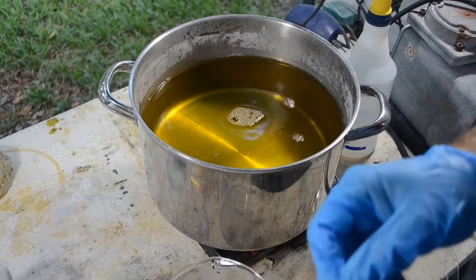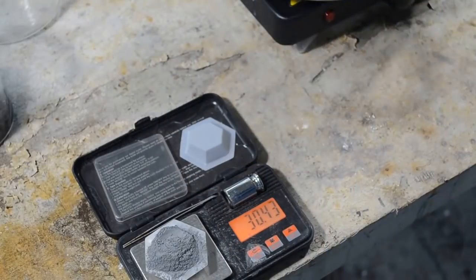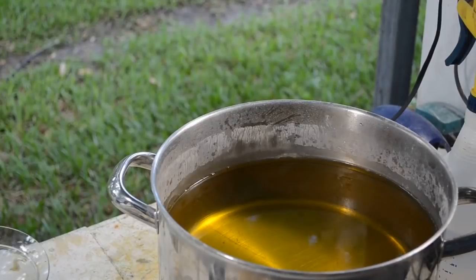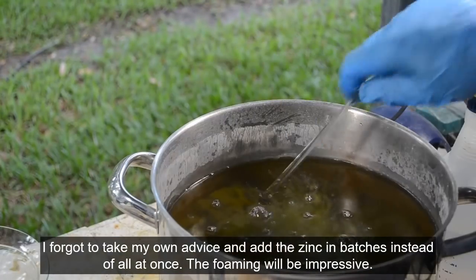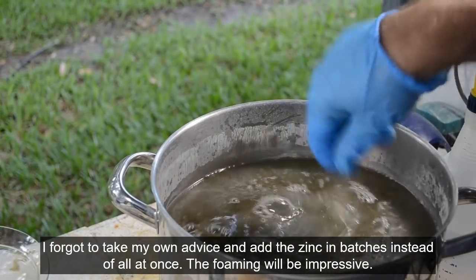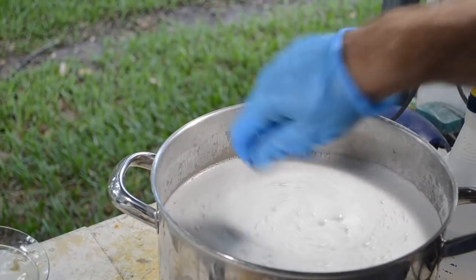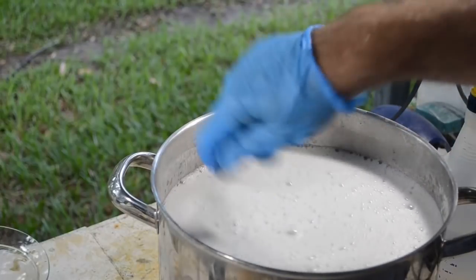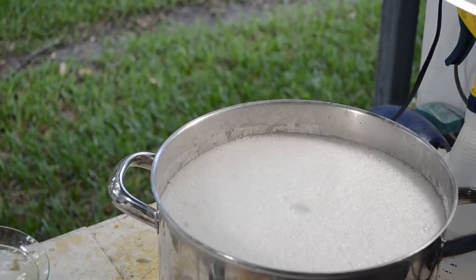Okay, so let me get the zinc ready and we'll do another cementation. Just like last time, I'm going to put about 30 grams of zinc in here and stir it in. What in the world happened to my stir bar? There it is. Gotta have that handy. Okay, get this second cementation under way. And here comes the foam. Not as bad as the first time around, I don't think, but definitely got a reaction going on. That's good. Okay. We'll just let that go.